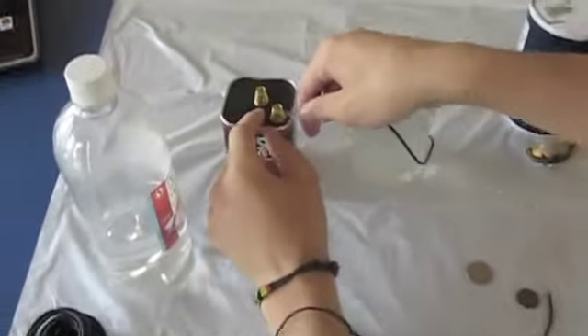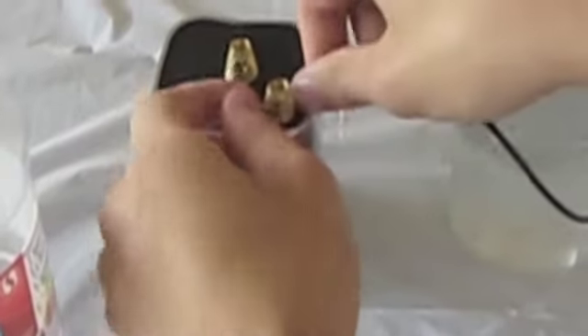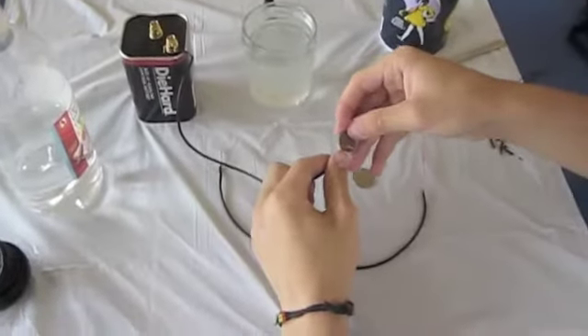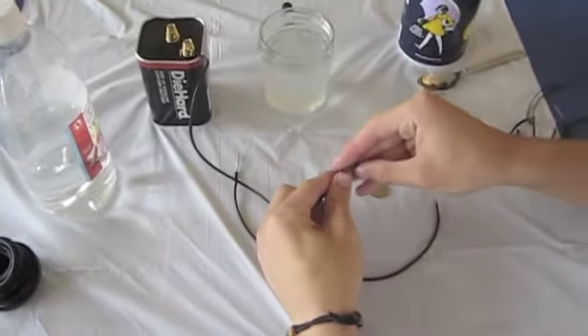We then took a wire and attached it to the positive side of the battery, then took the other side and securely tightened it to the penny. We used a penny from 1962, because it had a bit more copper.